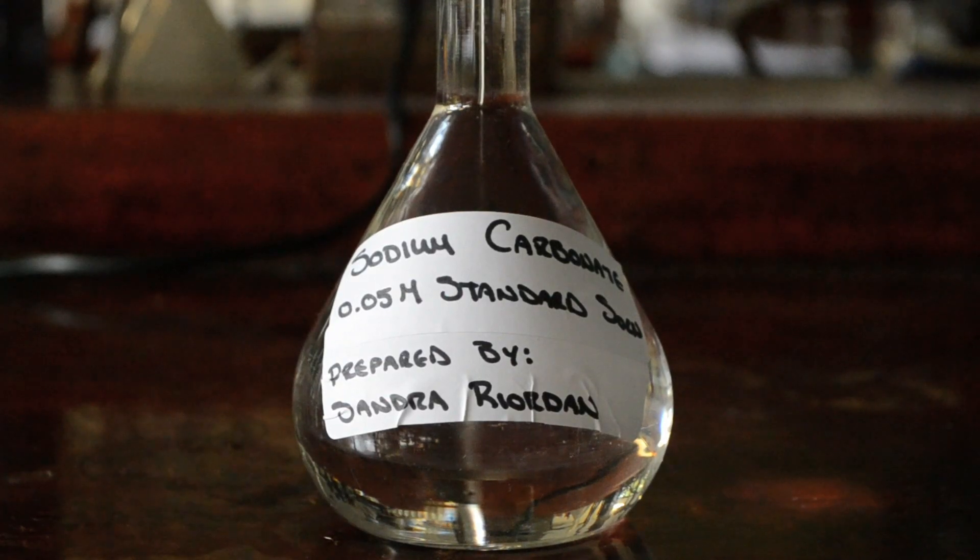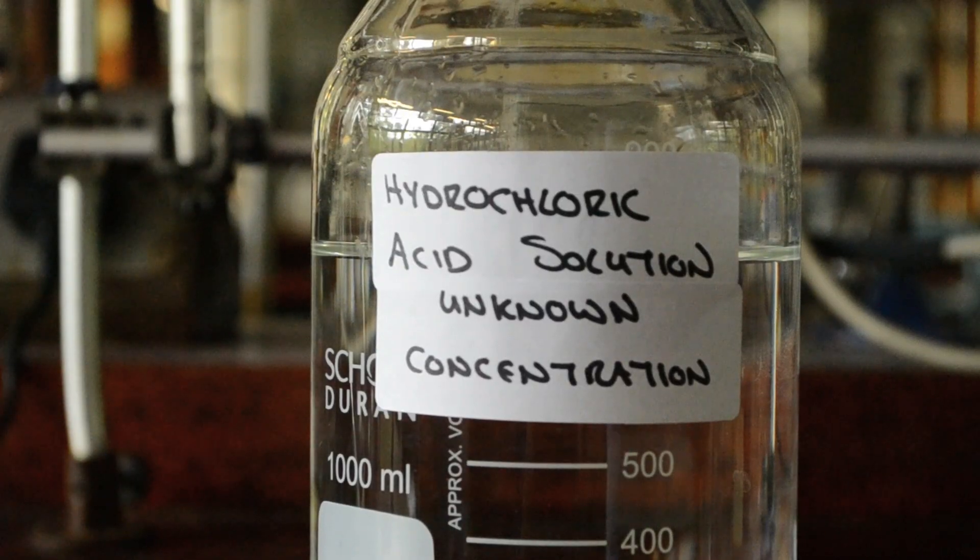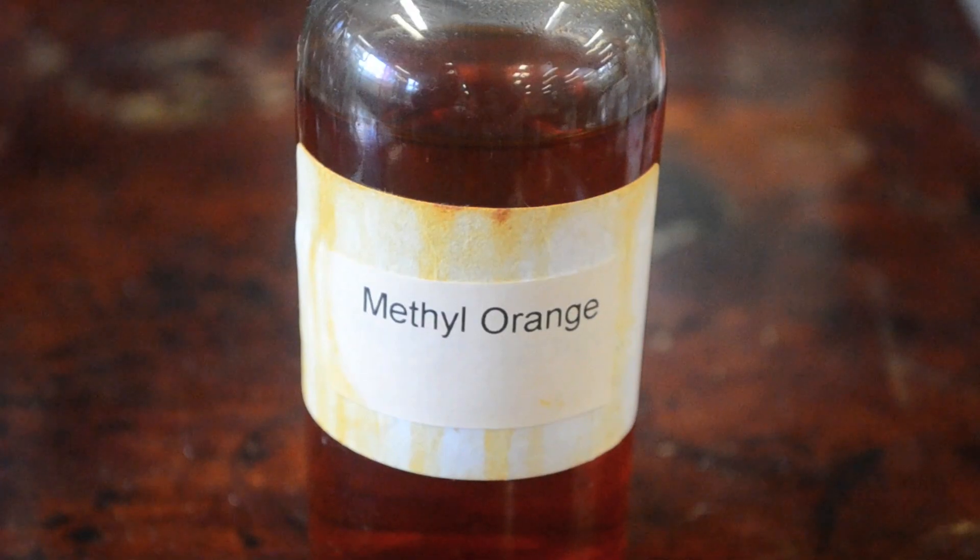Hi, I'm Sandra and welcome to the first of the acid-base titrations for the Levinsert Syllabus. In this titration, we will use a standard solution of sodium carbonate to standardize a solution of hydrochloric acid of unknown concentration. We will use methyl orange as the indicator. I will run through this titration in detail so that you can follow it in future titrations throughout the course.